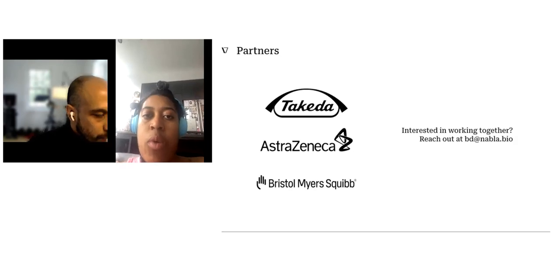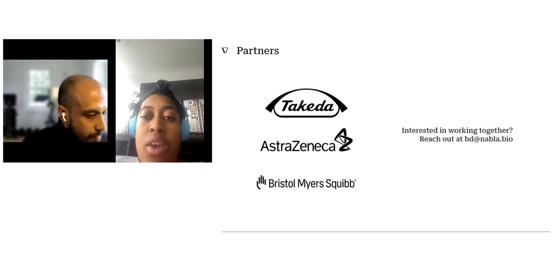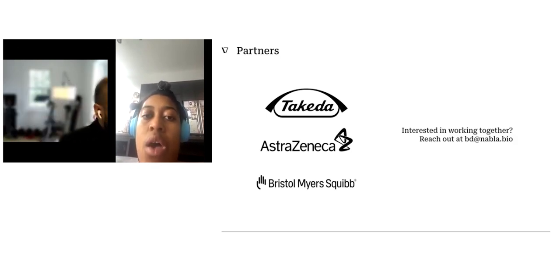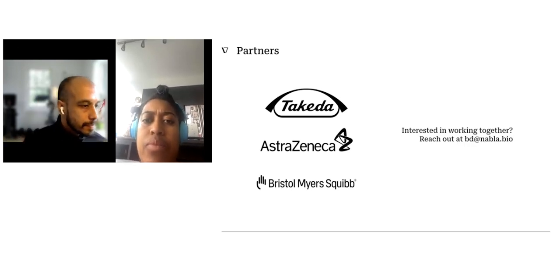Question number 1: was your solubilized GPCR also mostly monomeric in SEC and expressed well? Also, can you say whether the scaffold has nothing to do with normal GPCR structure, or that it does?